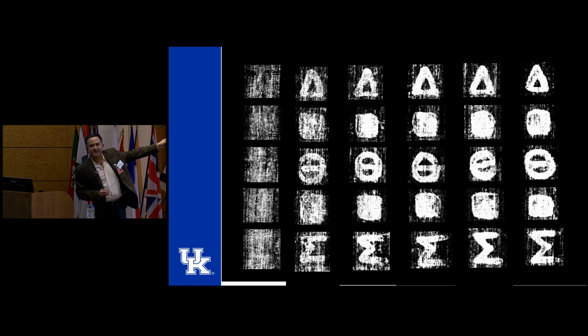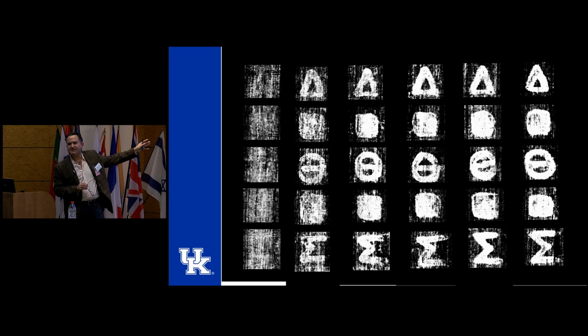Here we can see that just standard one stroke, just write delta once with the ink. It does have problems. It can't really tease it out. It can't find it. It's not differentiating ink, no ink. Go down the rows. Yes, the thicker it is, it can latch onto a signal, and that signal can be amplified to tease that stuff out.